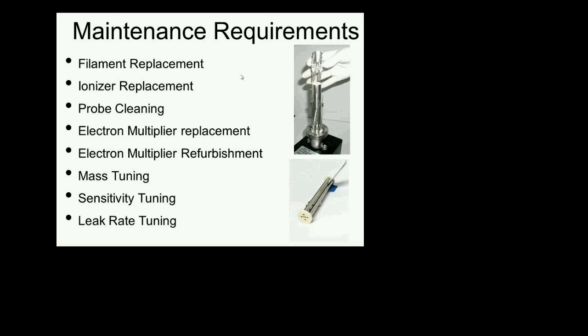In terms of tuning, you will have to do a mass tuning every now and then. This is very rare. Out of all the RGAs I have, over the 20-something years I've been doing this, I've only seen a couple go out of tune, but it's something you might have to do, especially if you're messing around with the settings. You will need to adjust the sensitivity on these devices, particularly if you're switching to different gases, and you will need to tune it if you're doing leak rate measurements and need quantitative results. So these are the things you're going to have to do routinely as part of the device's maintenance and tuning procedures. And I'm going to give you a couple of comments here.